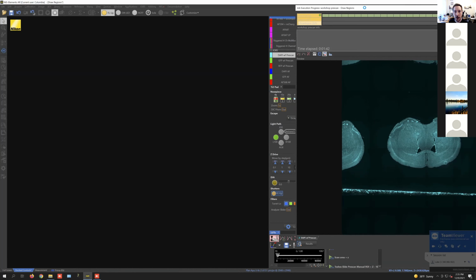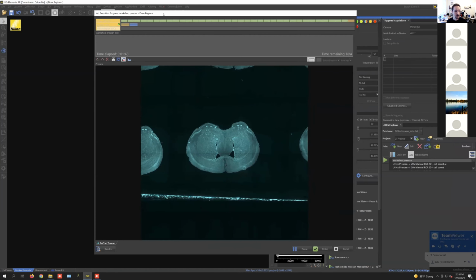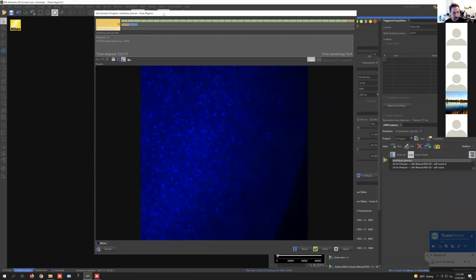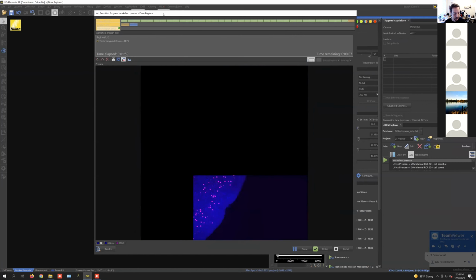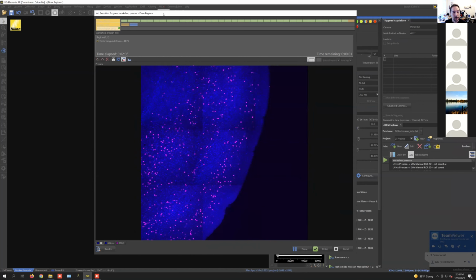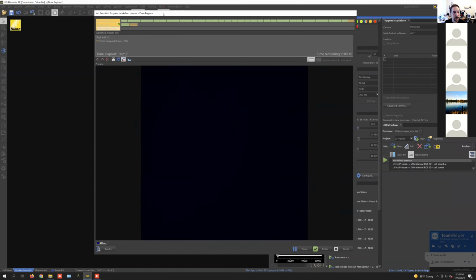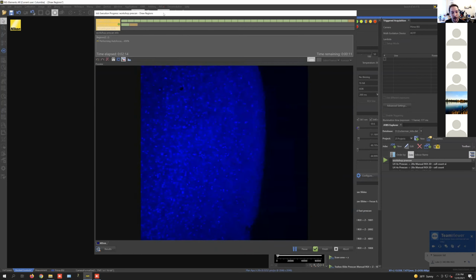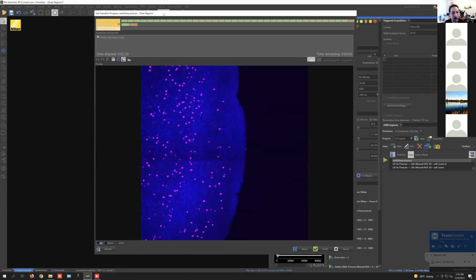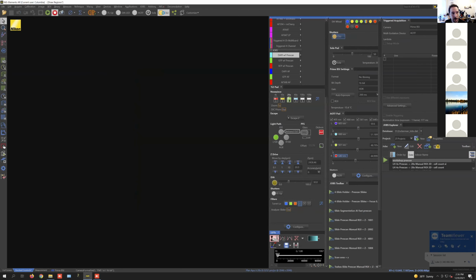And what the job will do now is image those separate tissue sections. This is auto-focusing, so you can see that quick sweep through, and then it's coming back, and now it's doing a finer focus just where the tissue was found, and now it's imaging. This is just some sparse labeling of some neurons in this brain section in far red.